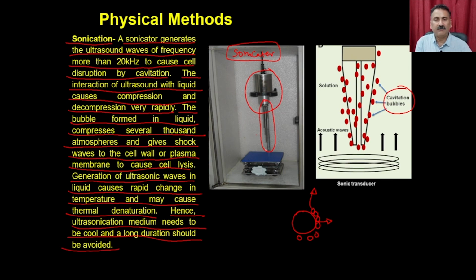Because the sonic waves are very high energy waves, they are going to cause a temperature change in the media where you are doing the sonication. So sonication has to be done under cold conditions, and you are going to put in ice and other such things.